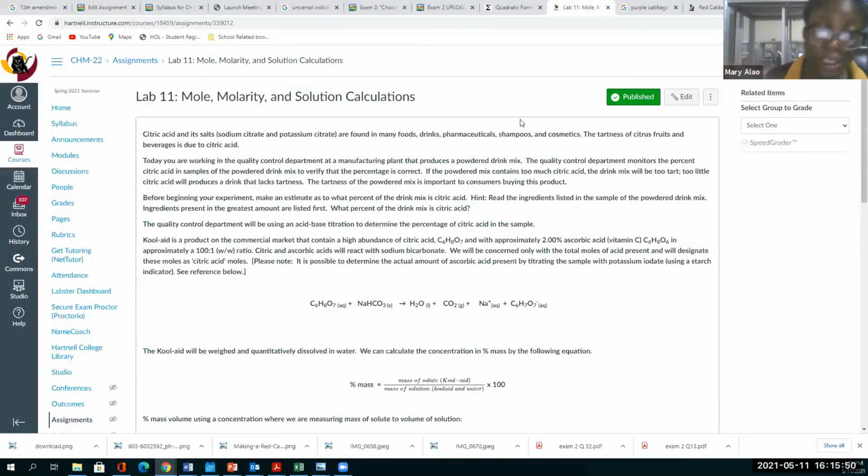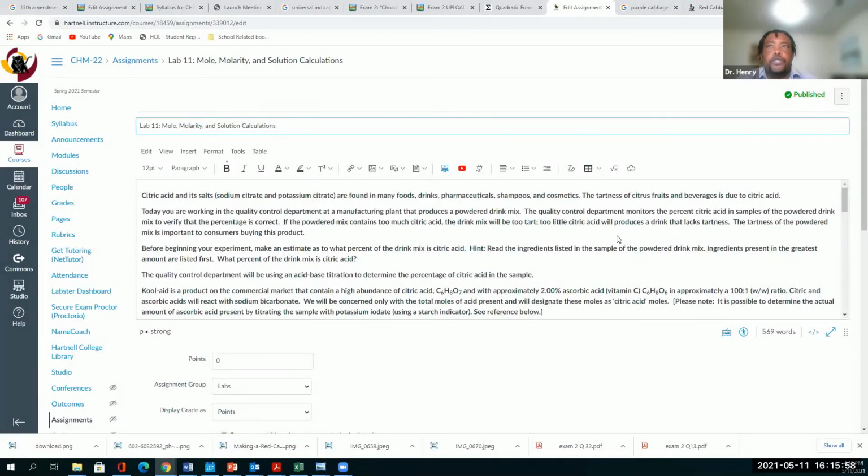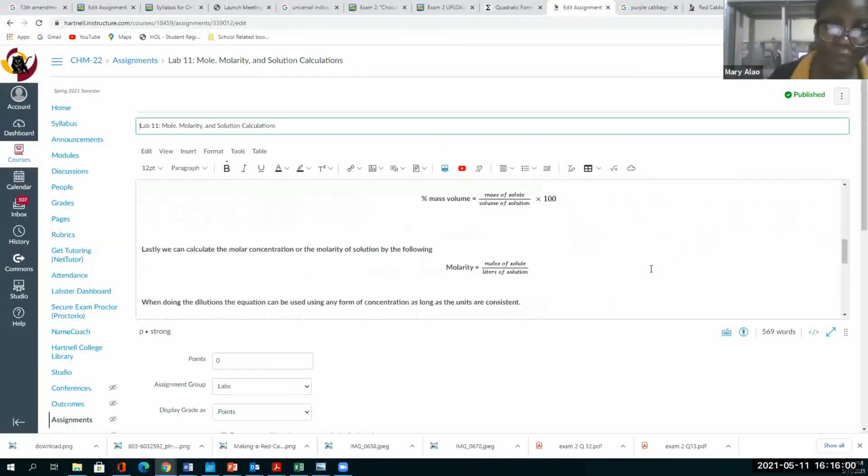Test tube 1 is the first stuff we did. That's the 10 milliliters. Do me a favor, refresh your screen right now. Okay.